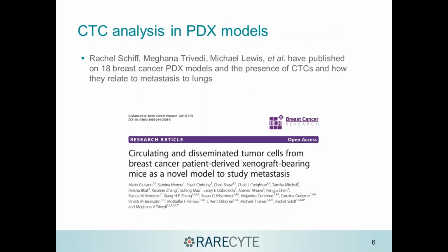The work that I'm going to talk to you about today was done in collaboration with Rachel Schiff, Meghana Trivedi, Michael Lewis, and others at Baylor College of Medicine who have published on 18 breast cancer PDX models and the presence of CTCs and how they relate to metastasis to the lungs. For this work, we tested a subset of these lines to enumerate CTCs and CTC clusters. We performed molecular analysis of single CTCs and studied the effect of chemotherapy on CTC number.